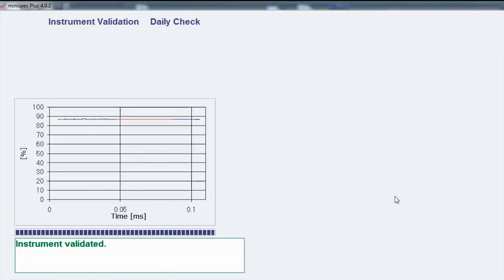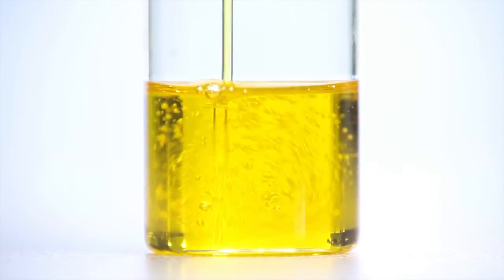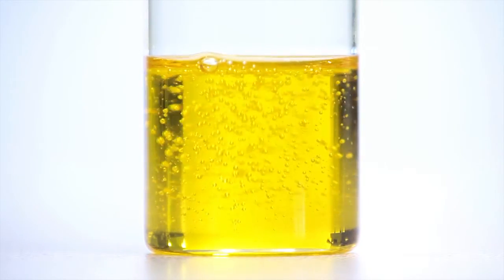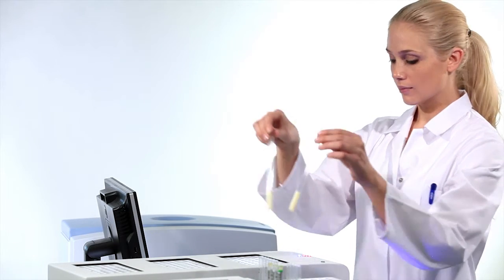The sample preparation is simple. Fill the tube with the sample and temper the samples according to the international standard methods.